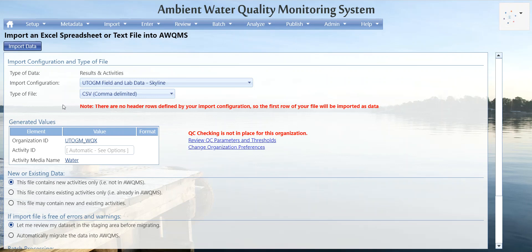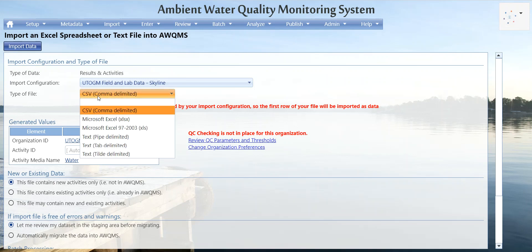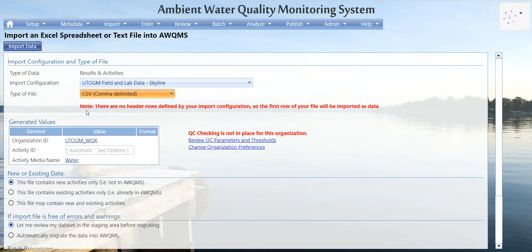It's set up in the import configuration to import a CSV file. If this ever changes, you can always switch to an Excel file or a text file. Note: there are no header rows defined by your import configuration, so the first row of your file will be imported as data. Make sure you don't have a header row in your file.